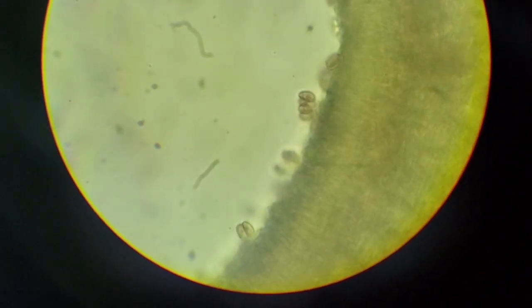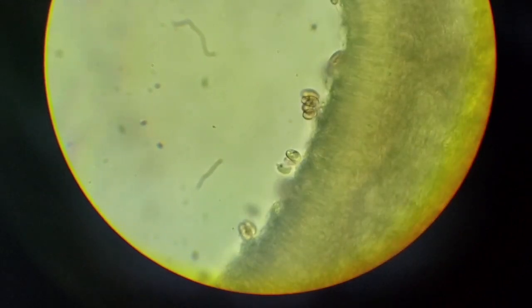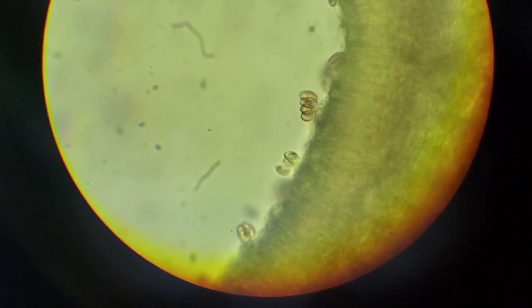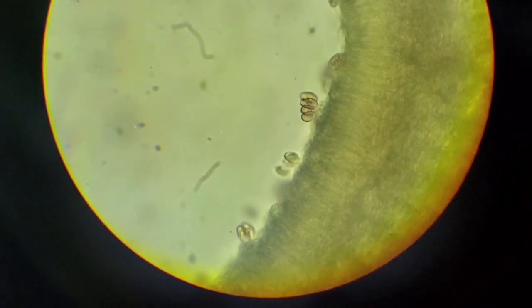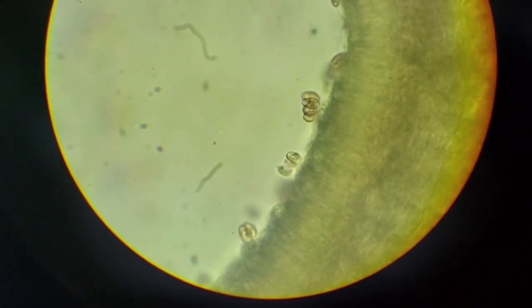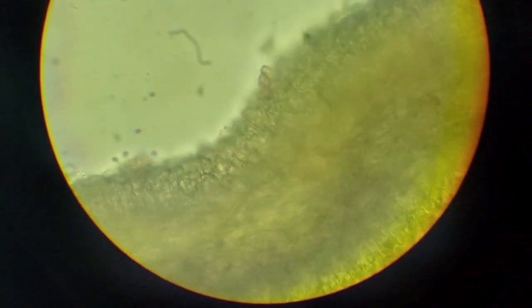And I'm sorry the video is shaky. I'm having to hold my phone in my hand against the eyepiece, and then with the other hand try to do everything else without really getting out of frame. So it can be a little tiring to watch. But this is pretty nice, and I like that their spores are naturally pigmented, because this is just water, so we can see them from far away. And so this is what you want to get.